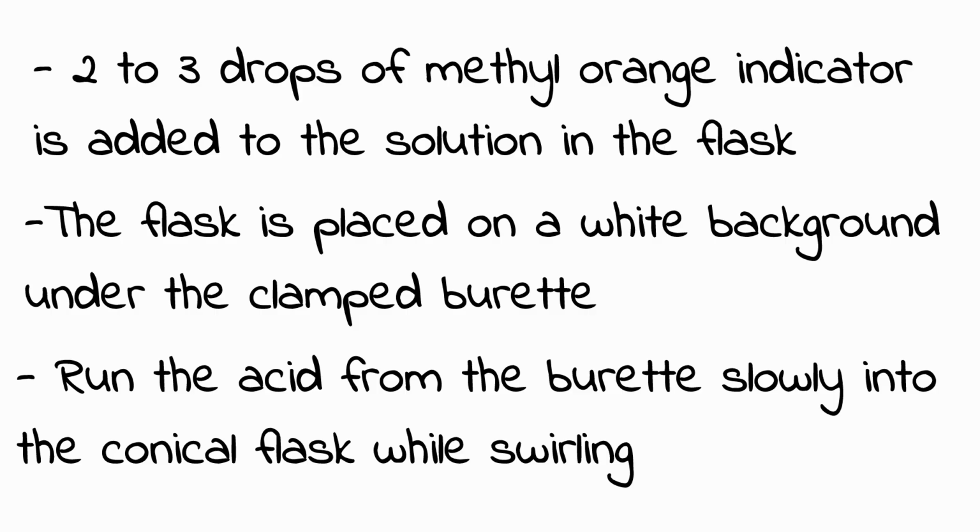We should also note their colors. We have seen it previously. The color of methyl orange in a basic solution, sodium carbonate is basic, is yellow, and at the end point it is going to change to pink.